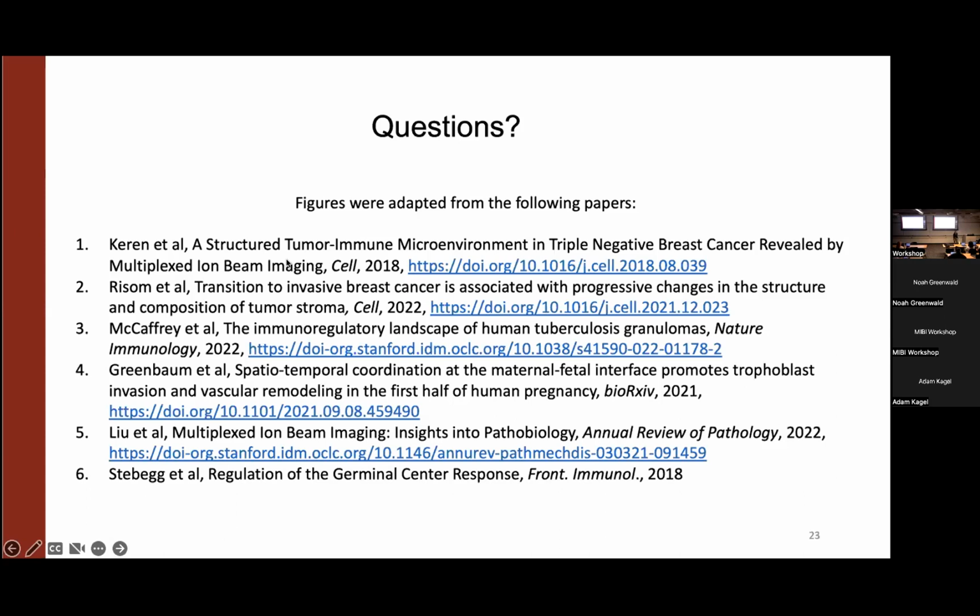No, it's a good point because there's actually stuff that we're interested in right now that has a lot to do with how tumor-associated macrophages and CAFs and stuff like that, how they're near or far away from remodeled ECM. So it's actually pretty cool.